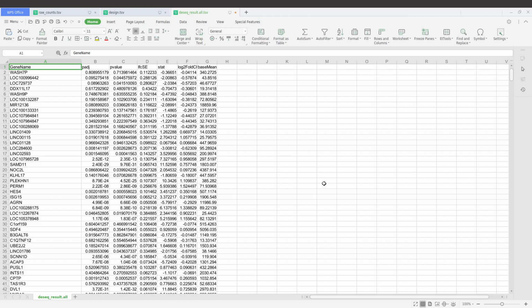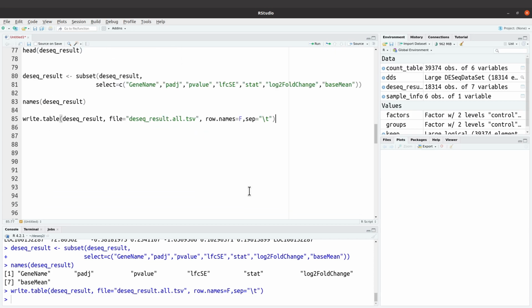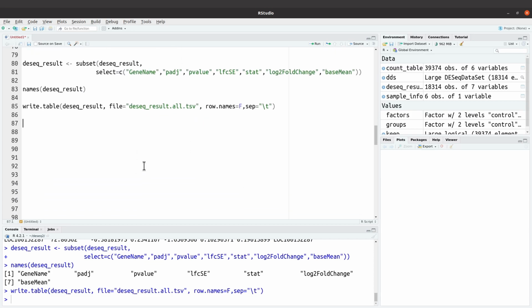So that's what we are going to do. We are going to filter and then select the most significantly expressed genes. We will do a subset, and we are going to save those to a different file. Okay, so that's what we are going to do. So let's get back to the R environment and then do that. So I'll just open R. Now let's do this. Okay, we are back. That'll be the next step.